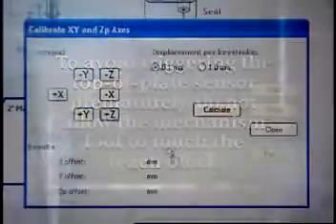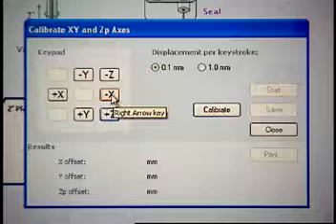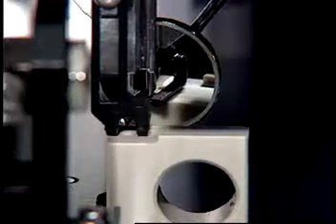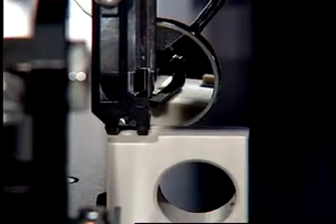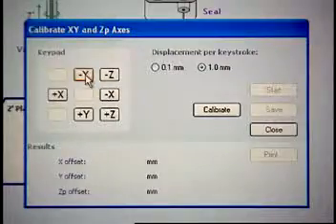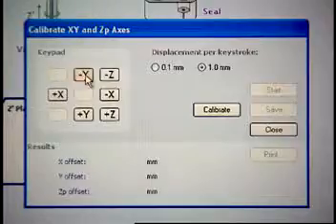To laterally position the puncture needle, use the plus X or minus X button to move it left or right, respectively. With the aid of a small mirror, use the plus Y or minus Y button to adjust the front-to-back location of the puncture needle so that it is centered over the needle hole.